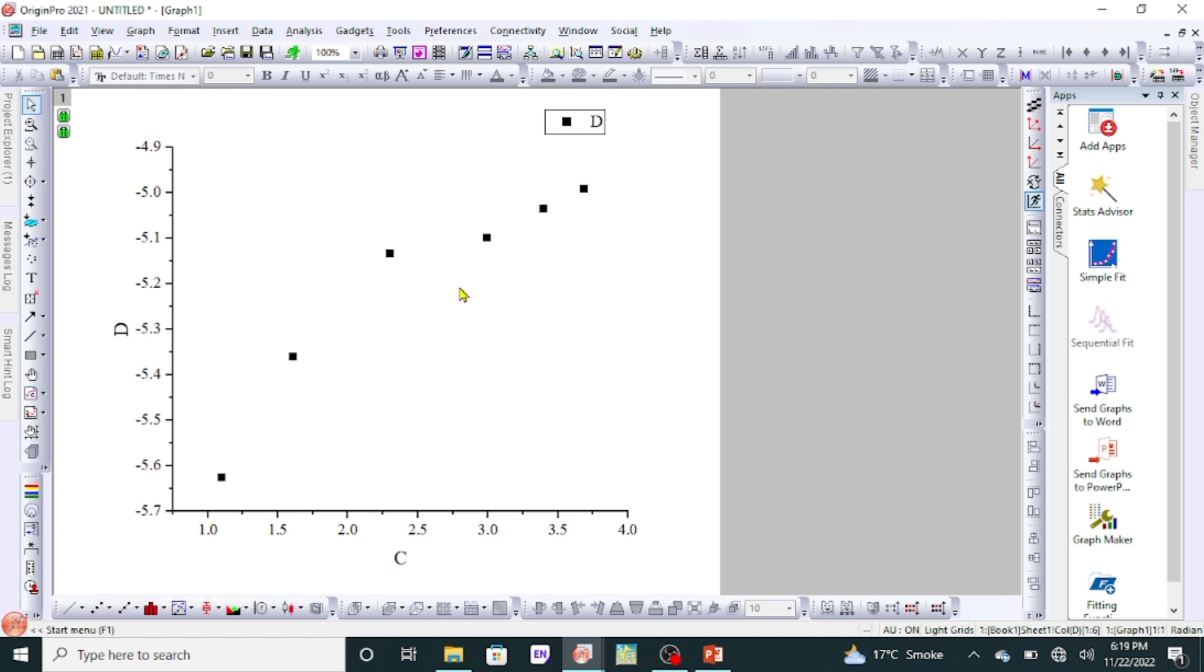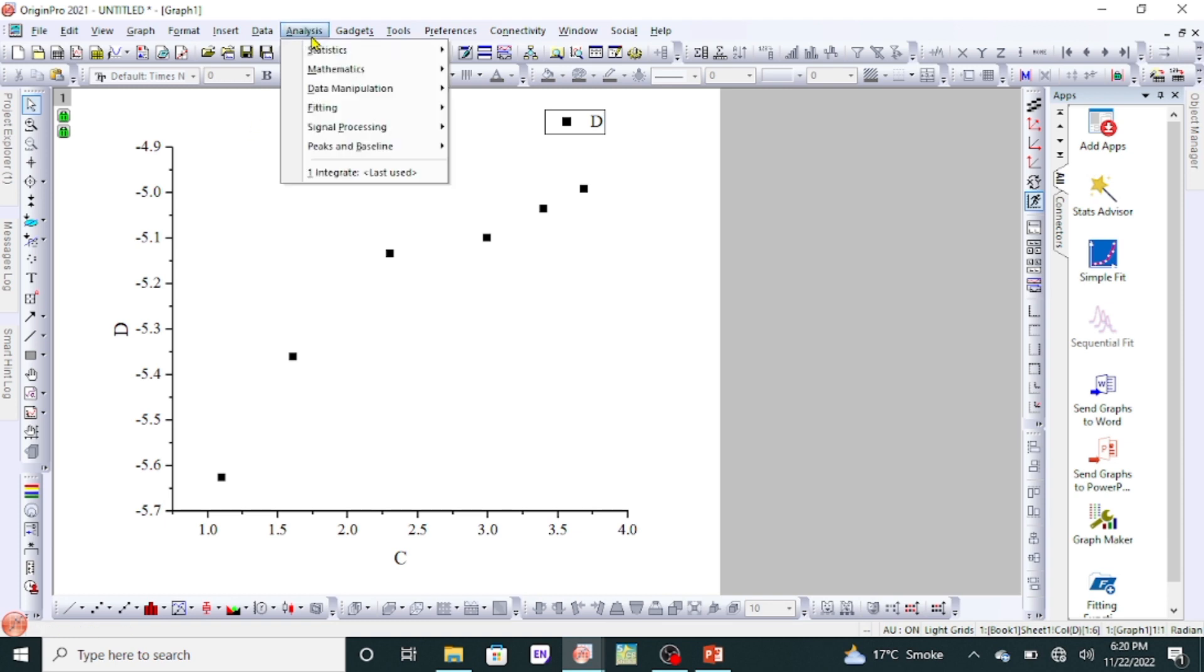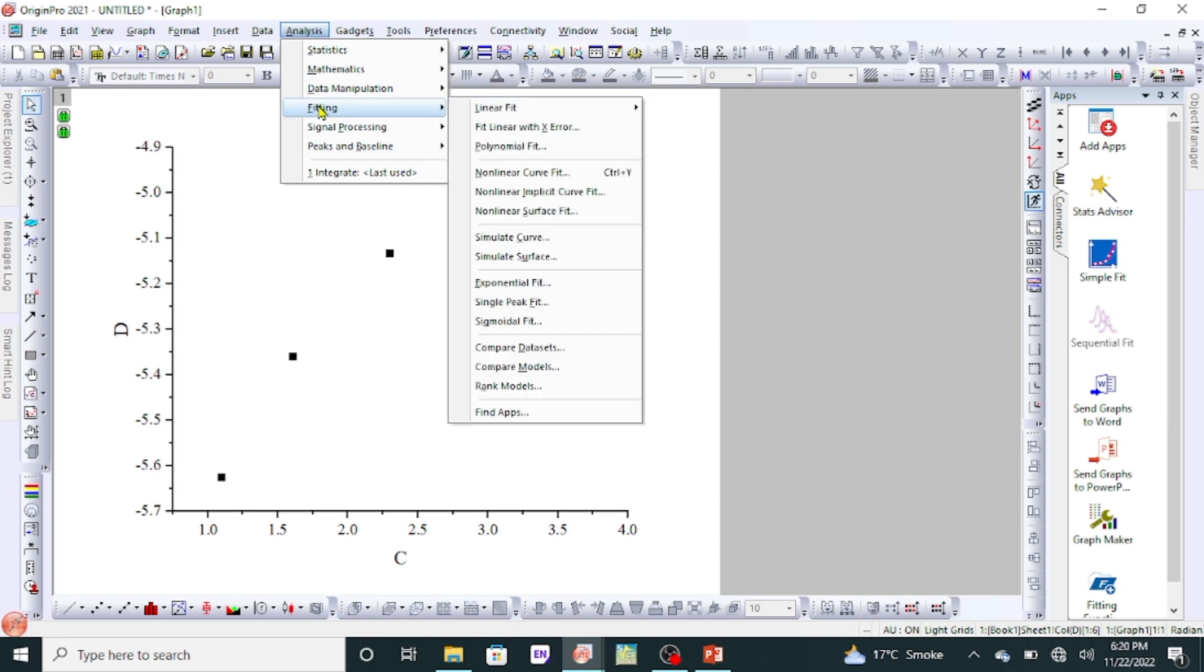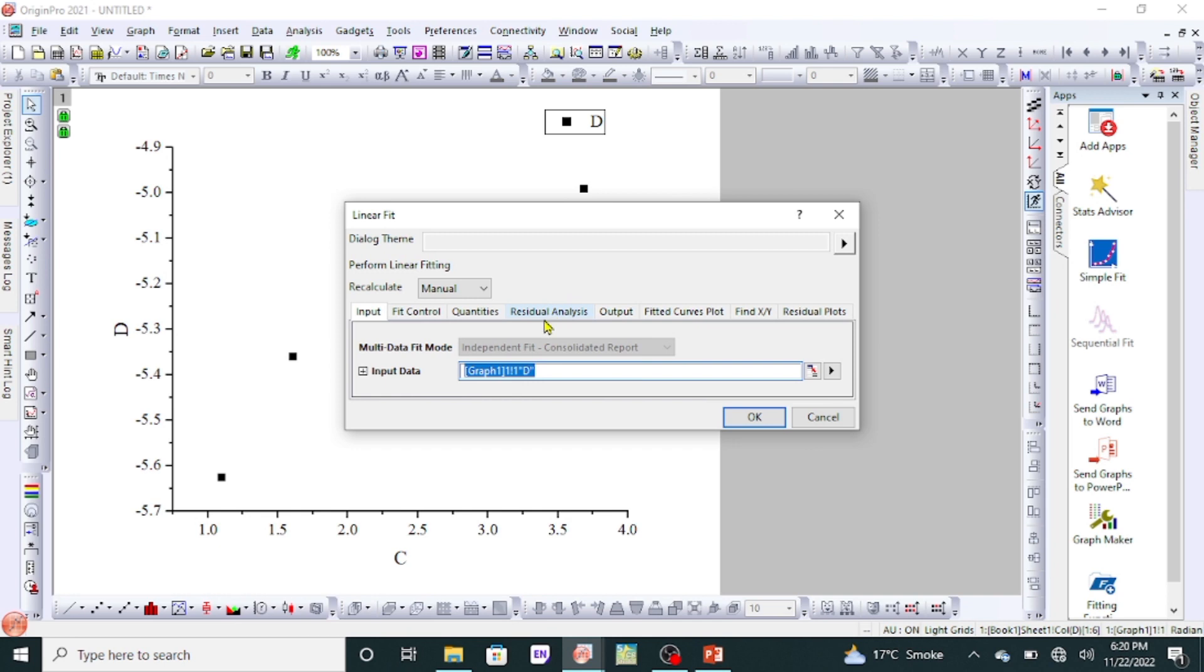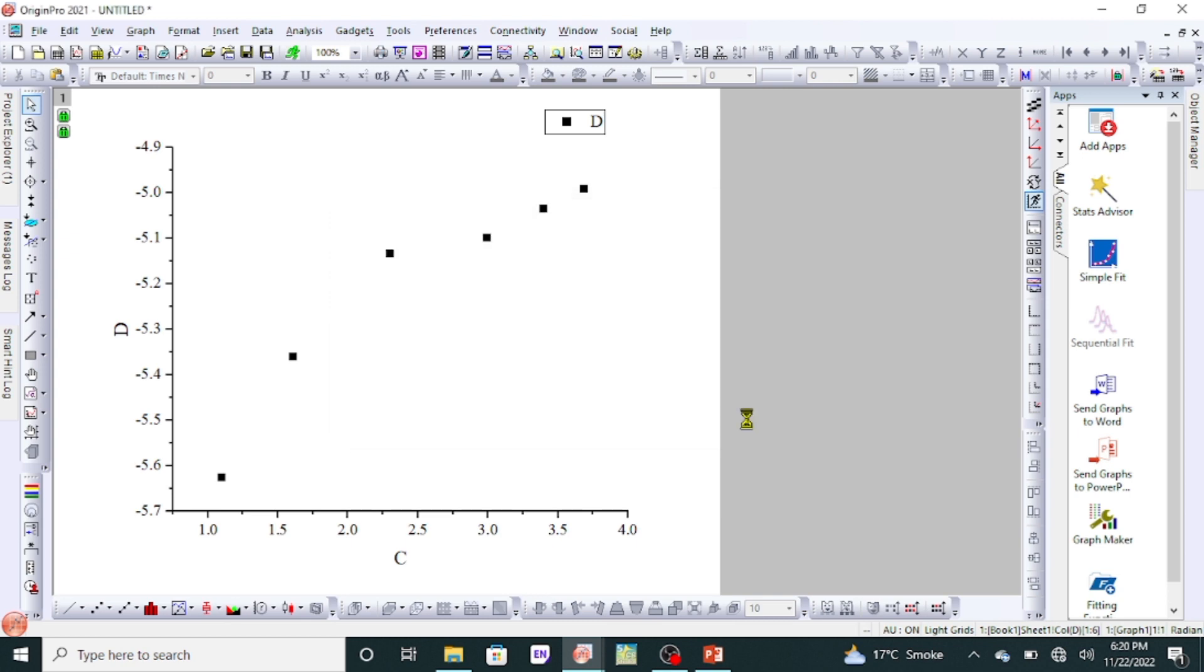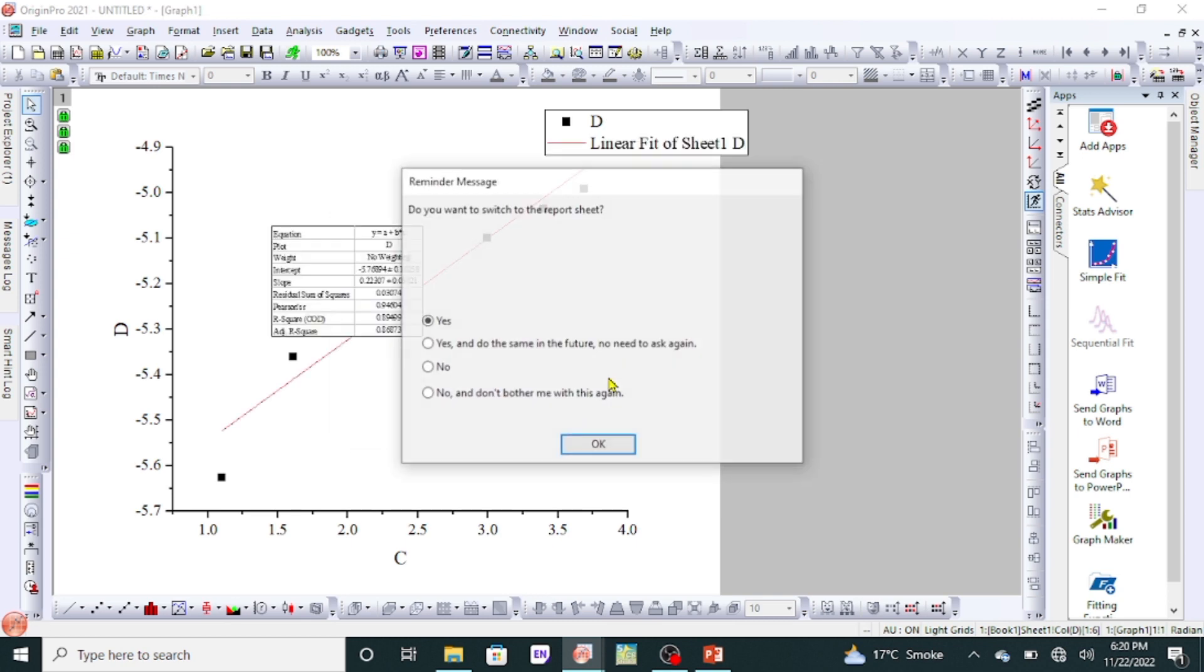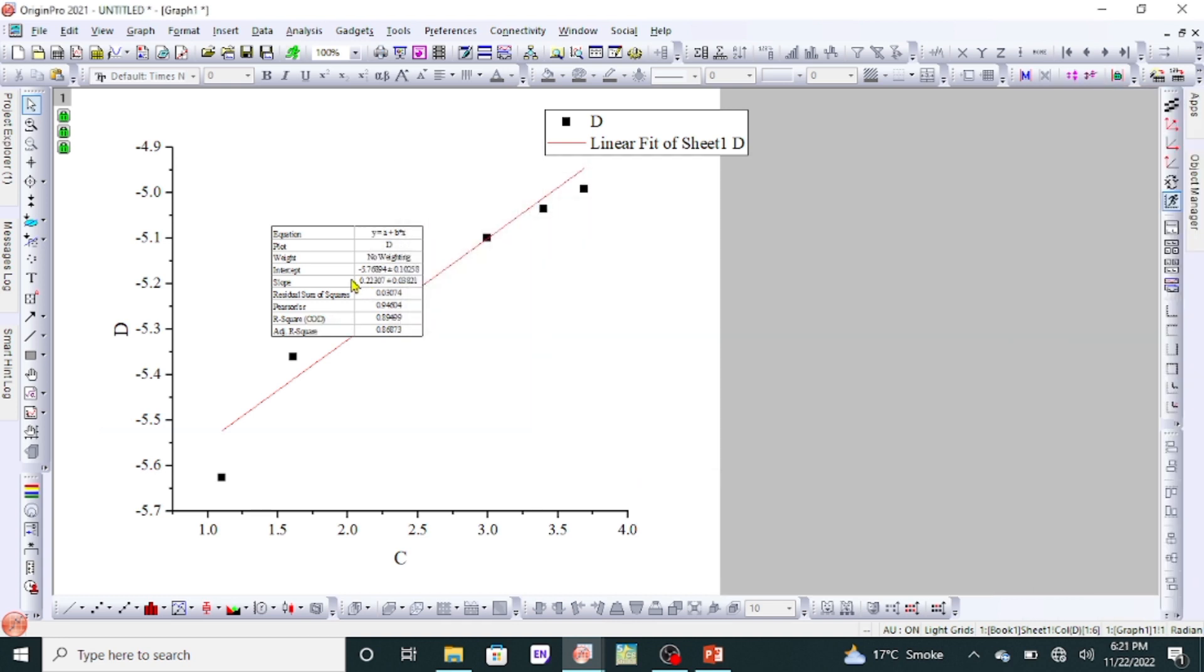Now what we have to do is go to Analysis, and then on Fitting, scroll down to Fitting and scroll down to Linear Fit, and then open dialogue. You will see this type of window. Click OK, and then again OK. Here is our slope value. You can see here the fourth row, you can see the value.